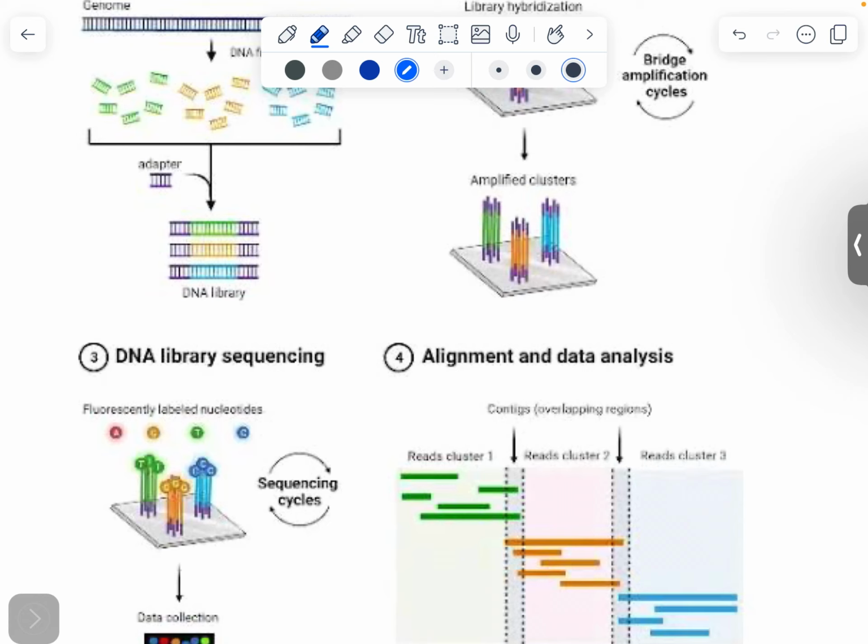We can eliminate these three reads which are showing the mismatch, and we can confirm that these mismatches are due to PCR bias, or a fault while amplifying the particular region during the PCR reaction.